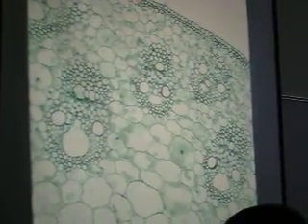Okay, monocot stem, number 8, corn. How do you know it's a stem? Multiple vascular bundles are all over. How do you know it's a monocot? They're scattered. There's no order. Okay? So if we look at it, actually this is parenchyma right here. There's some parenchyma right under the epidermis. Okay? But here's the parenchyma. See how one parenchyma cell can get almost as big as a vascular bundle.